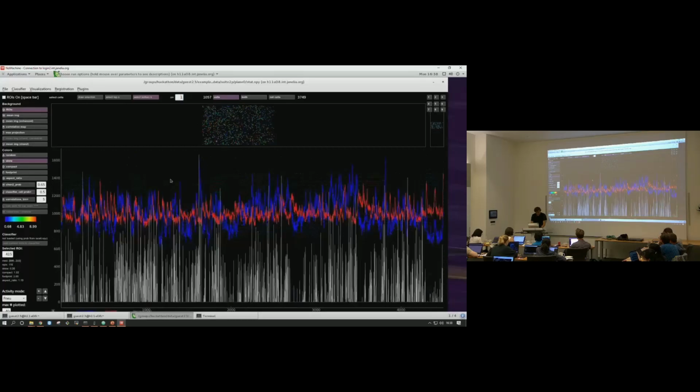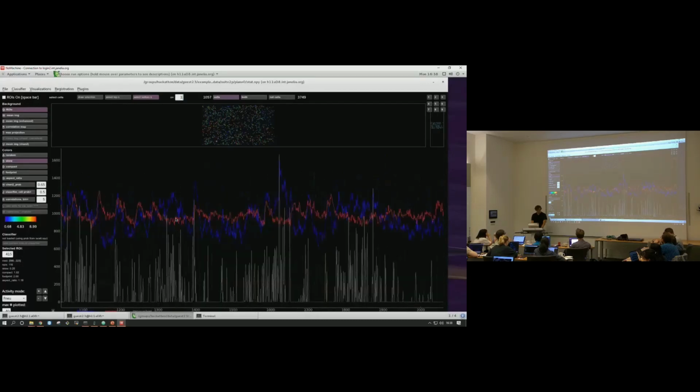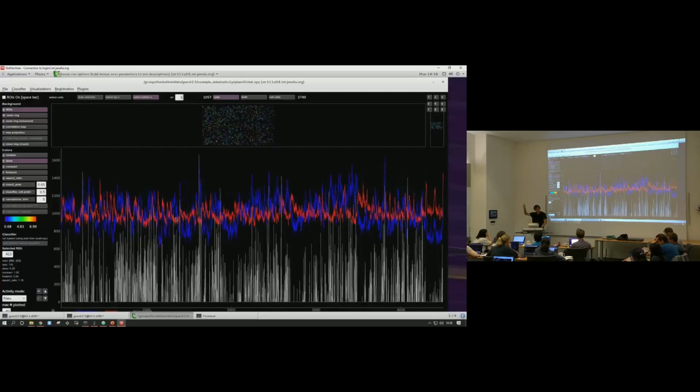And for this cell, for example, it's actually nothing like the neuropil. Right, so this is one of the examples that has transients riding on top of transients, riding on top of transients. It's just activity throughout, right? And it's kind of nicely modulated all over the place, all the time. And it's not because of the neuropil. It's just this cell had a high firing rate. So its skewness is 0.25, but it's not a bad cell. It's a good cell.